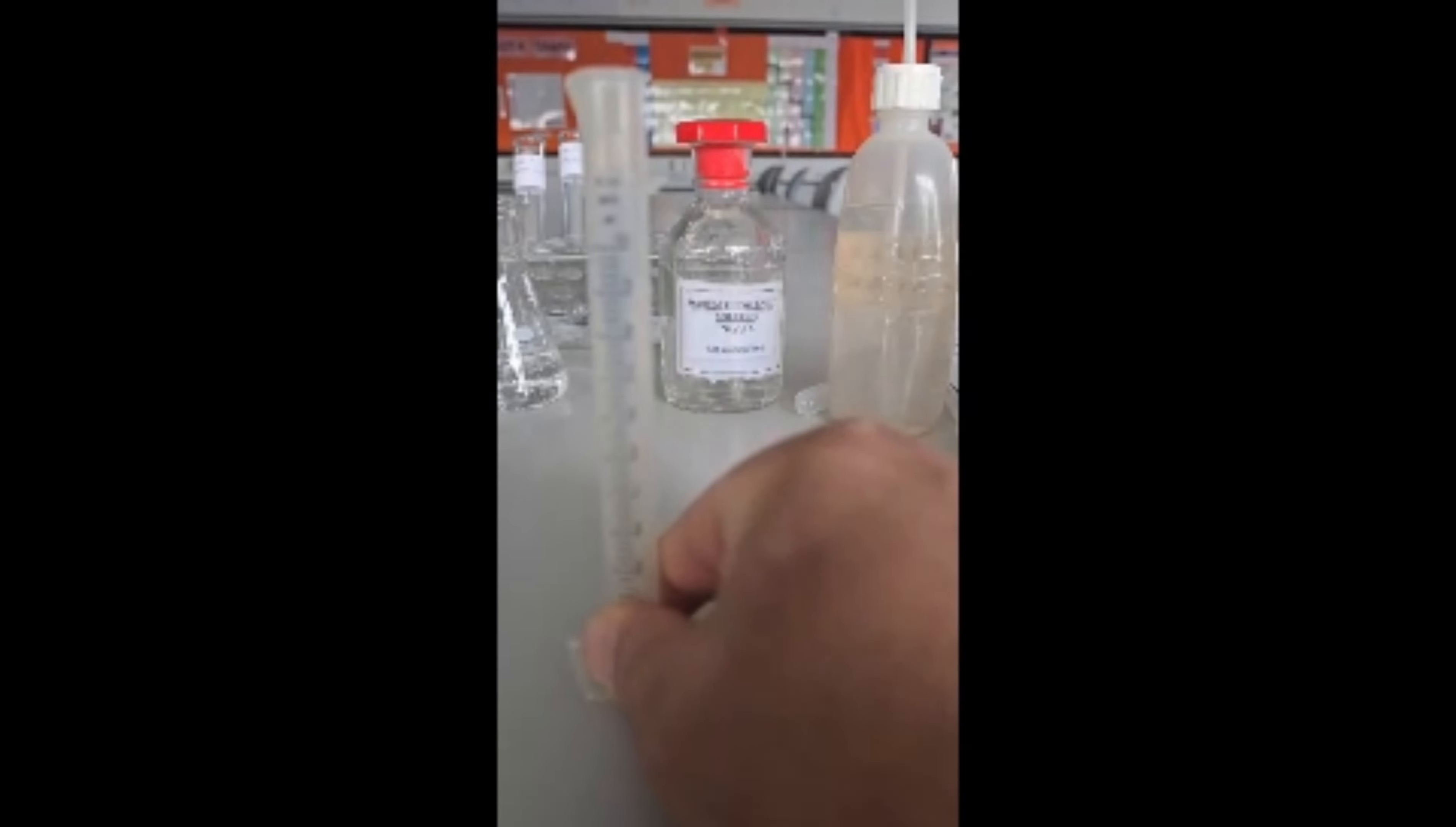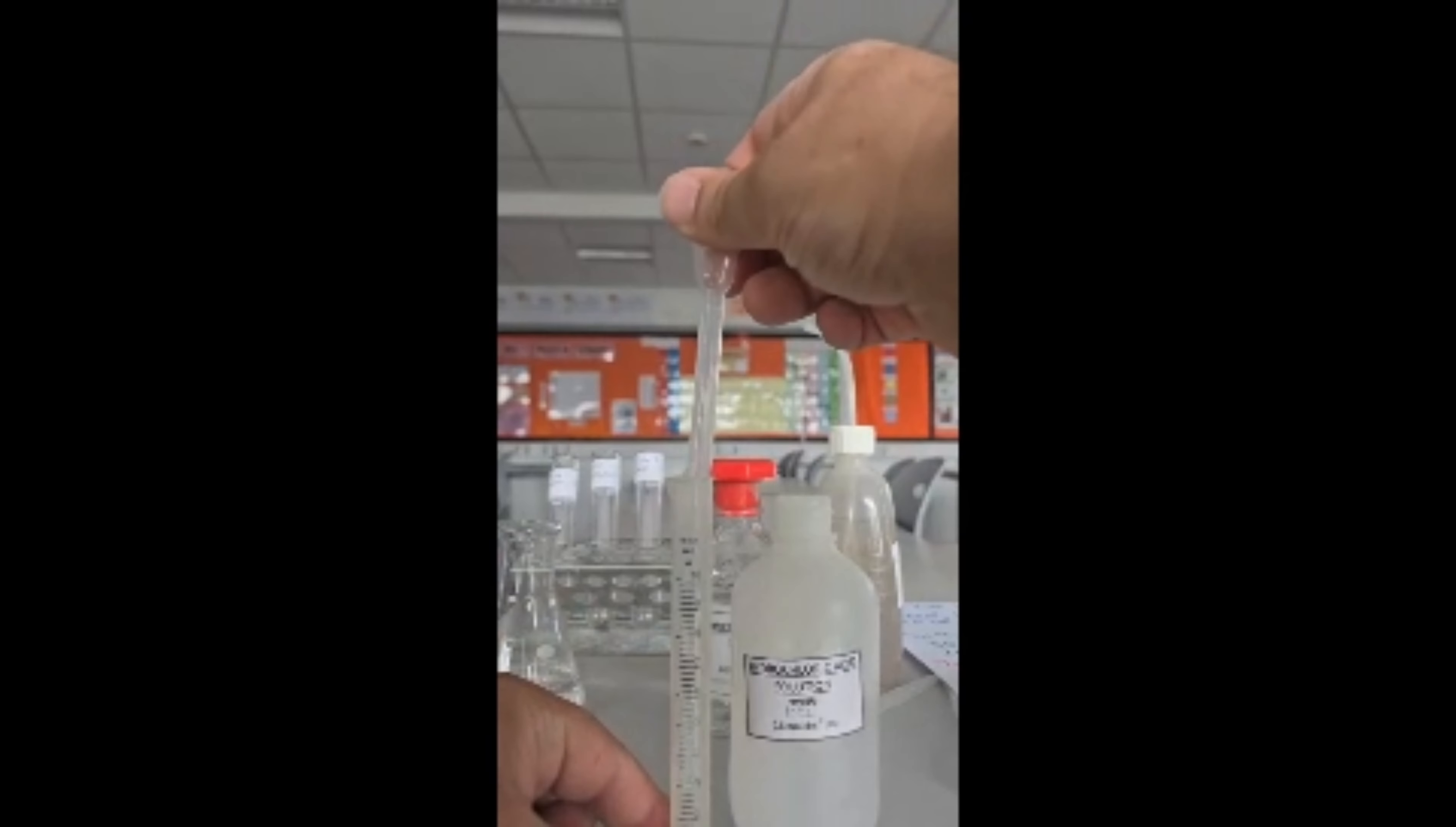Transfer that to the conical flask. Use a 10 centimeter cubed measuring cylinder and place into that your hydrochloric acid. We are measuring 10 centimeter cubed of the hydrochloric acid.